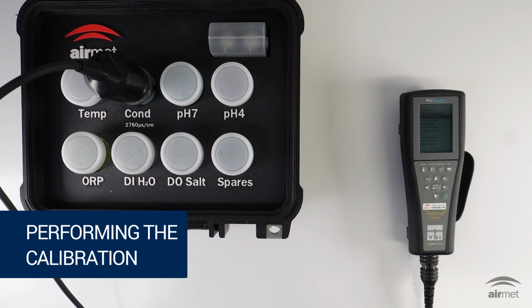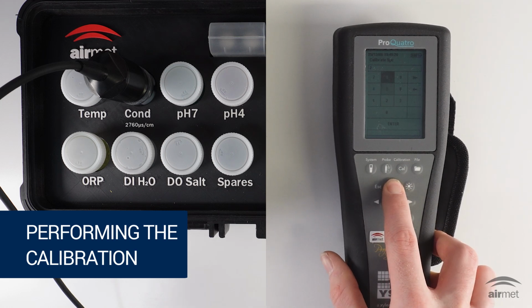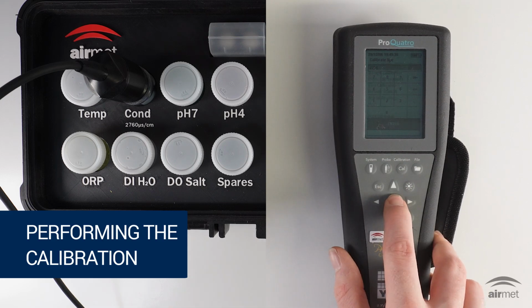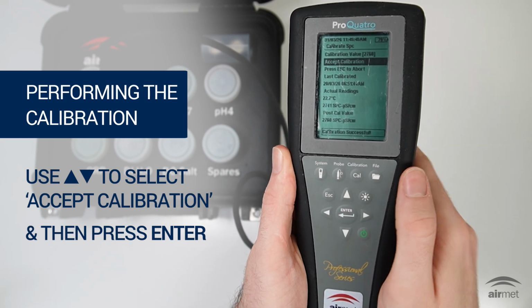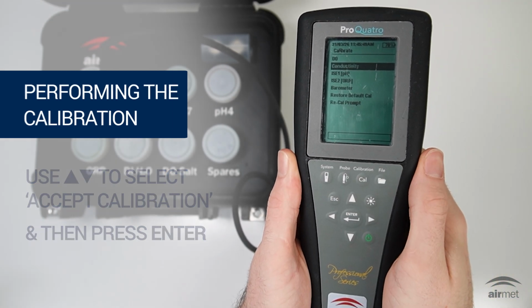When stability is reached, highlight the calibration value and enter the exact value printed on the calibration standard label. Confirm by pressing Enter. To complete the process, highlight Accept Calibration and press Enter. If the calibration is successful, the message Calibration Successful will appear at the bottom of the screen.